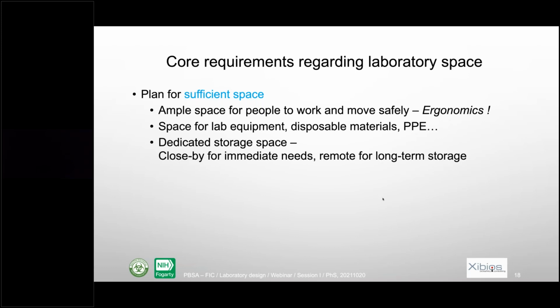Also, sufficient space for lab equipment, disposable material and PPE, for instance. Don't underestimate that. Lab equipment takes some space, and over time you might need to have more equipment. And you also need to have dedicated storage space. That's what we generally try to do: we keep in the lab the things that we need on a daily basis, and we have a remote long-term storage for all the other things that you don't use all the time.